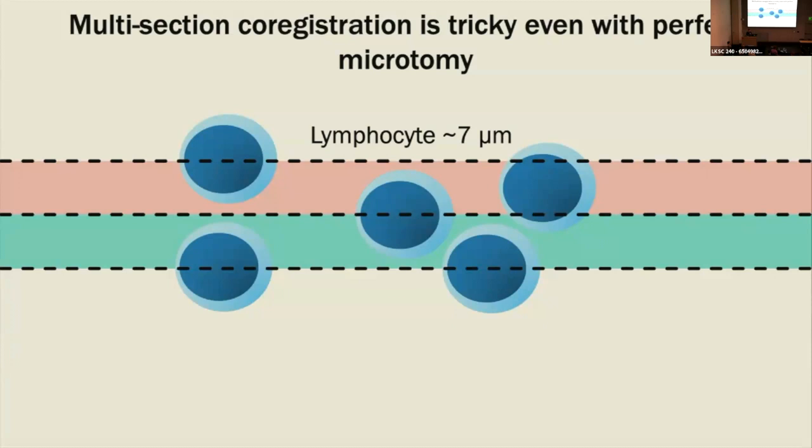And in terms of fixation, people have done a lot of studies, and I think the consensus was that fixation beyond 24 hours or so wasn't terrible, but once you get too far beyond that, it can get worse. But underfixation is also a big problem, and underfixation was more of a problem than overfixation. I haven't looked at those particular studies in a while. I think it's worth seeing, for whatever tissue you're looking at, if somebody's actually done those studies.